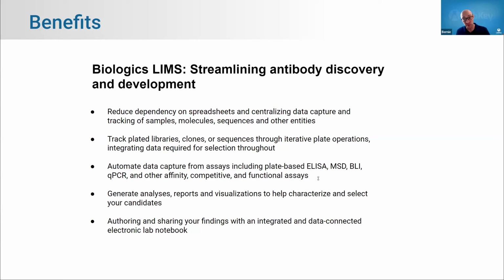There are many other aspects of Biologics LIMS that I didn't show you today. Things I didn't dive into: freezer management, media tracking. But I do want to briefly call out our data-connected electronic laboratory notebook that's built in, so that in the same system in which you're doing your work, capturing your data, doing a lot of your reporting, you can comprehensively author and report your findings as well.